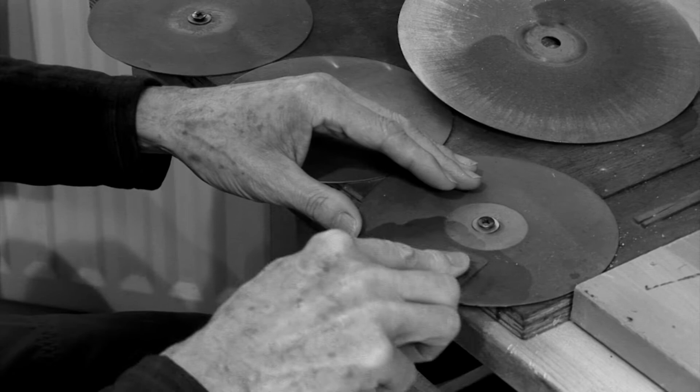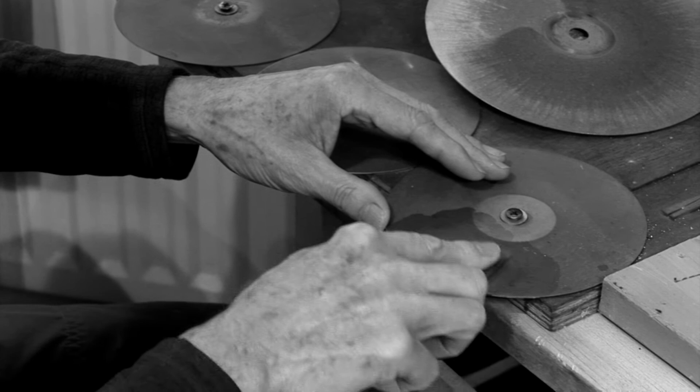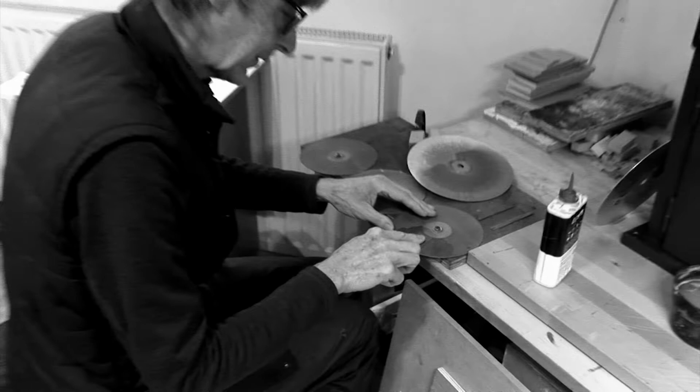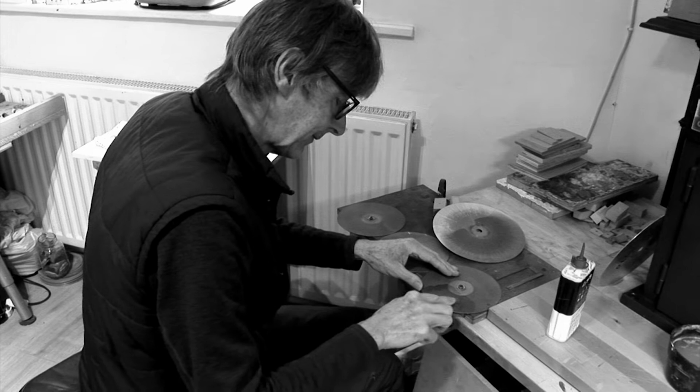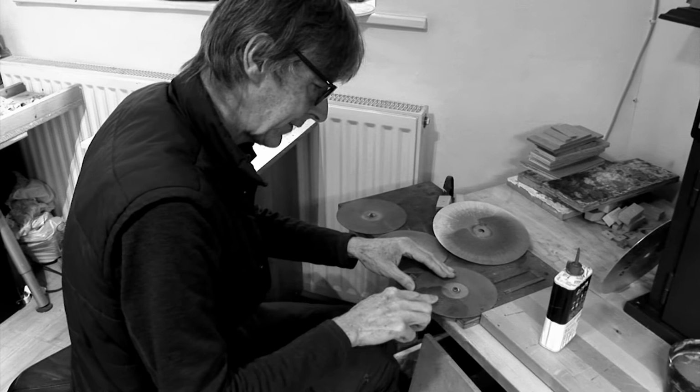I wouldn't classify it as being creative, but you're making, and there's not much difference, I don't think, between making and creating. So I'm making this thin section, and I could do it poorly, or I could do it well, so there's quality involved. If you're making and you're thinking about quality, then it's engaging anyway. And it's exciting too, because at this stage, I'm going to put it under the microscope next, and it's at that stage you discover really what you've got.